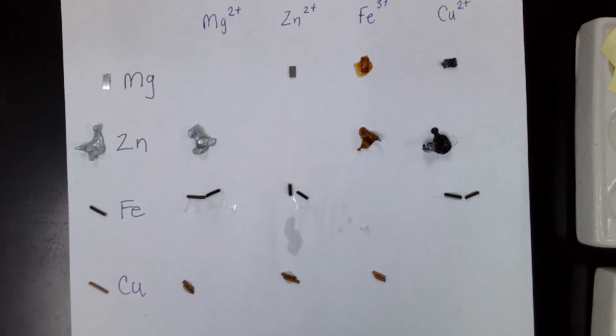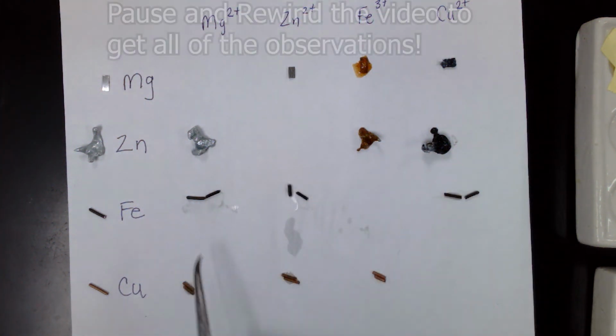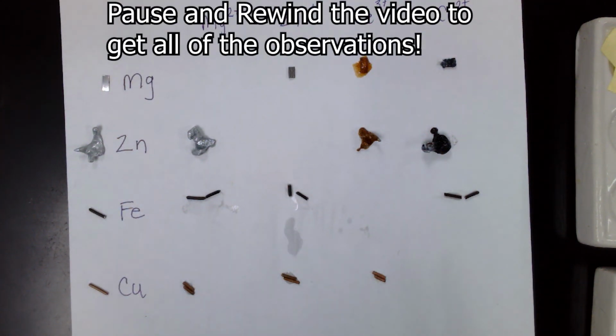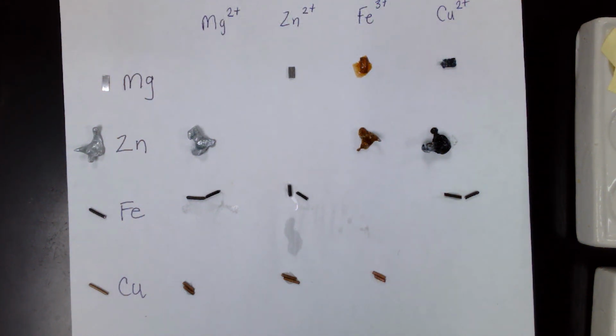So you can now compare the metal that was in the well plate now to the original metal that came from the jar. So note any surfaces or any changes you saw to the metal. So record observations if your metal has changed color. And also as you were watching the video, if the solution was changing color as well, make sure you record those observations.